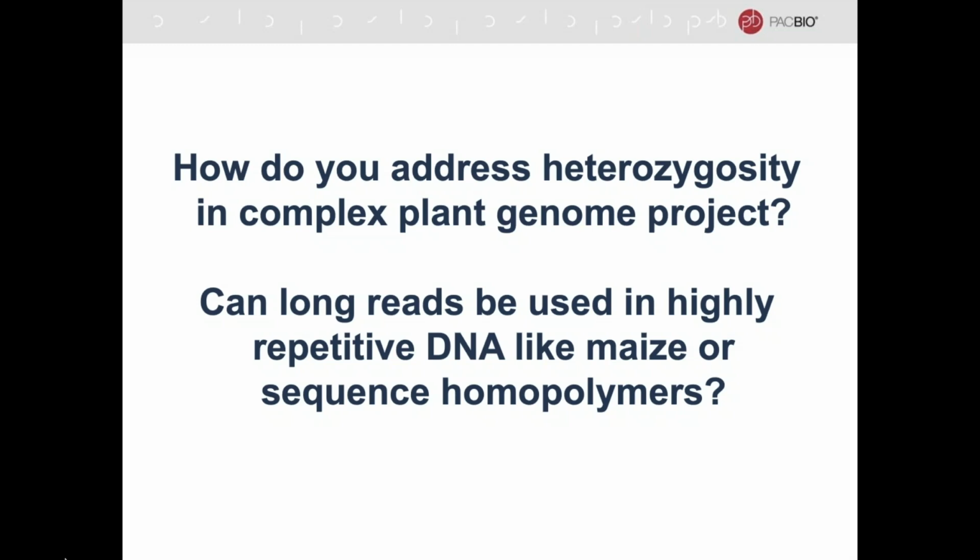based on flow cytometry. So I think, especially with these polyploids, you need to try to find some way to do that upstream, because we've actually had pretty bad luck. I mentioned we use Falcon to assemble; unzipping and purging haplotigs into two even-sized contig pools has not worked well for us. And I suspect that has something to do with the fact that it's an octoploid and not a diploid.